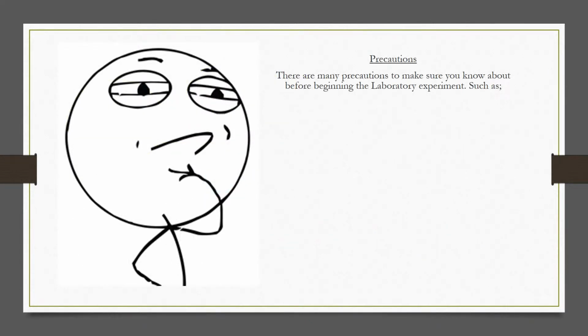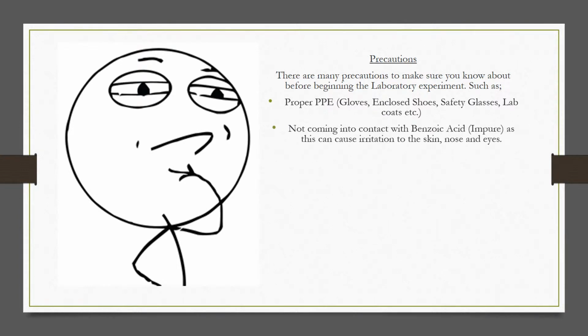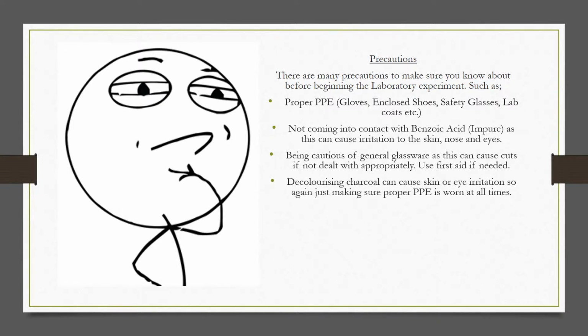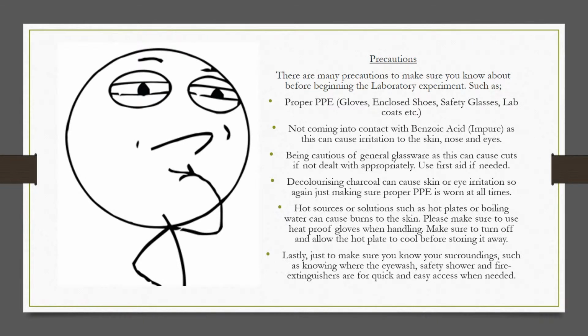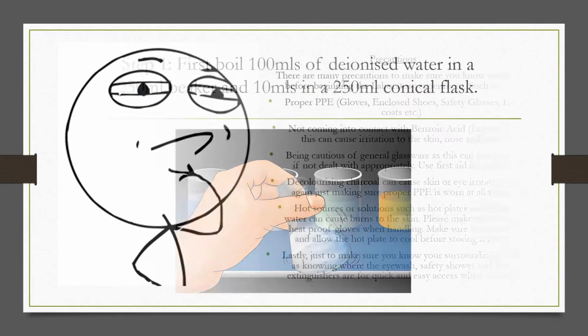Before we begin, there are a few precautions we need to consider. The proper PPE equipment, not coming into contact with the benzoic acid, being cautious of general glassware as it can cause cuts, decolorizing charcoal, hot sources or solutions such as hot plates or boiling water. Lastly, just to make sure you know your surroundings, make sure you know where your eye wash, safety shower and fire extinguishers are for quick and easy access.